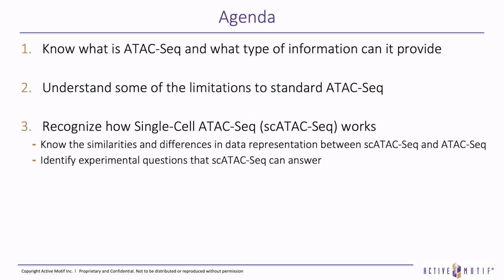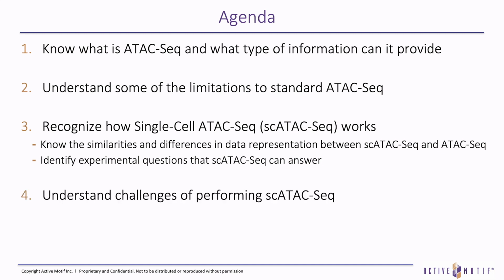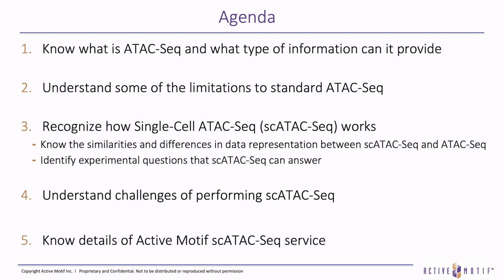Recognize how single-cell ATAC-Seq works, including knowing the similarities and differences in data representation between single-cell ATAC-Seq and ATAC-Seq, and identify experimental questions that single-cell ATAC-Seq can answer. Furthermore, understand what type of challenges one can encounter when performing single-cell ATAC-Seq experiments. And lastly, I'd like to leave you with some information regarding Active Motif's single-cell ATAC-Seq service.